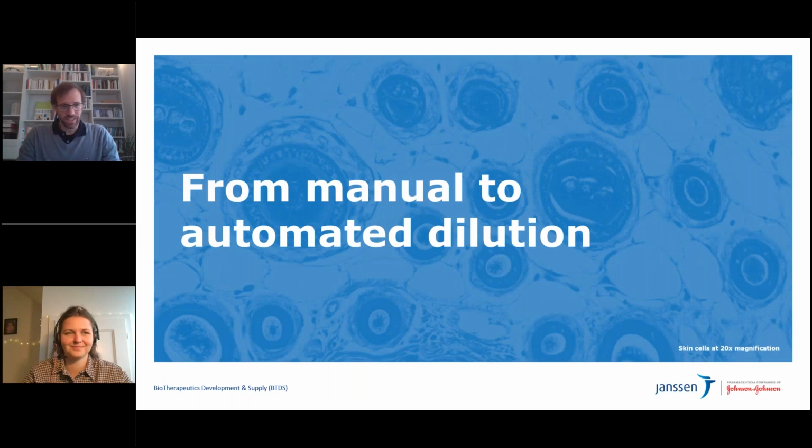With this, Renata, I would like to hand over for how we got from this manual part to the automated dilution. Thank you, Marius. Good morning, good afternoon, everyone. So I will guide you through the principles of the algorithm we built for dealing with the automation of the dilution process, as Marius anticipated.